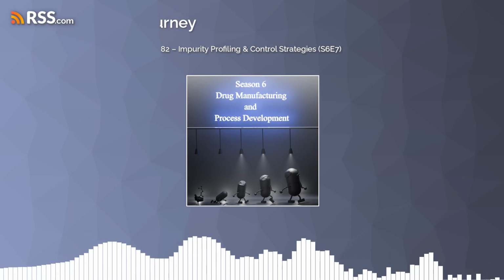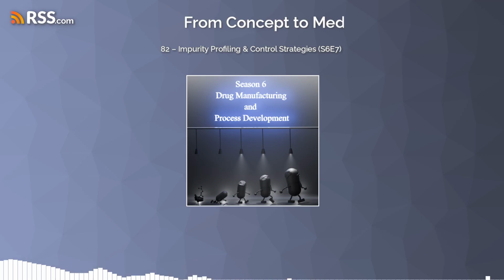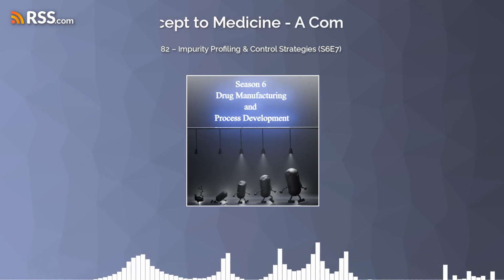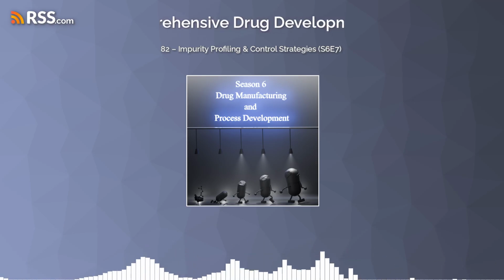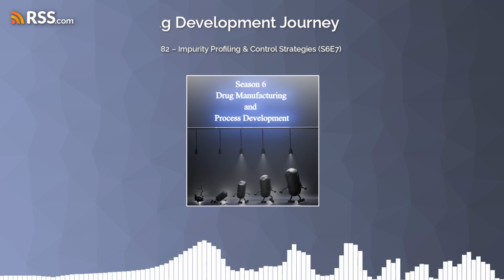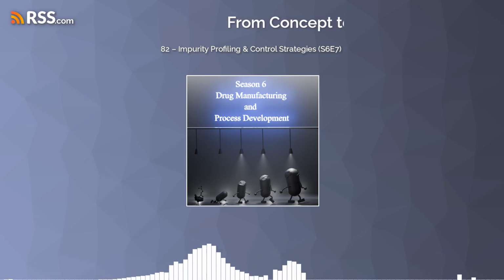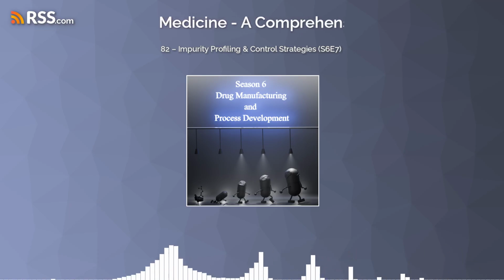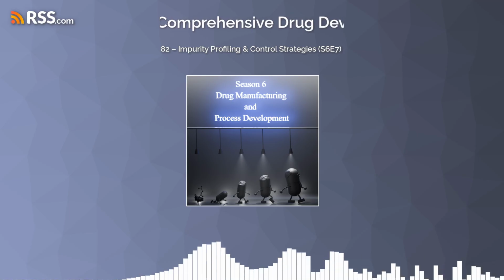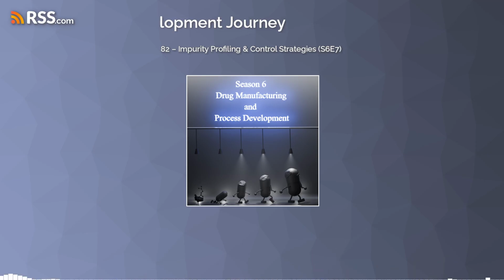Absolutely makes sense. Now, another technique that sounded super cool, almost futuristic, was continuous flow chemistry. Oh, yeah. That's definitely a hot area in pharma manufacturing. Instead of doing reactions in big batches, they use this mini chemical factory, a network of tubes where they pump the reactants through. So like a little assembly line. Yeah, kind of. And because of that, they can control all those reaction parameters super precisely. Temperature, pressure, how long the ingredients are reacting.